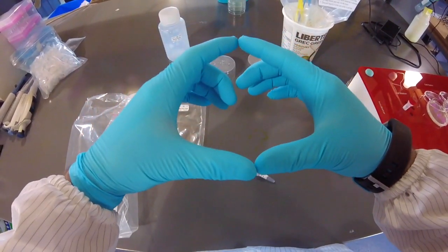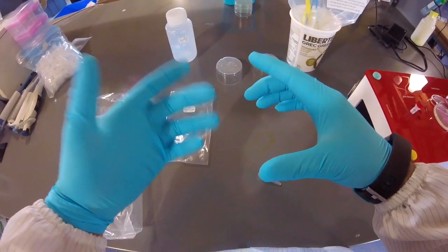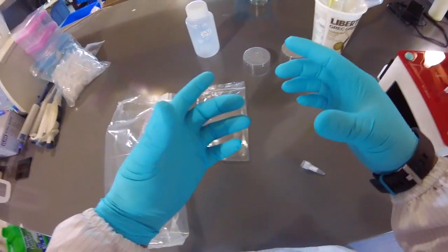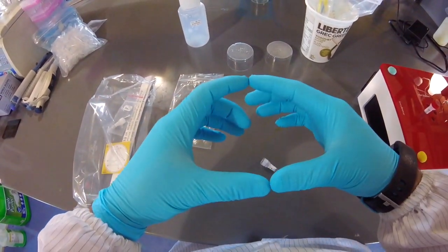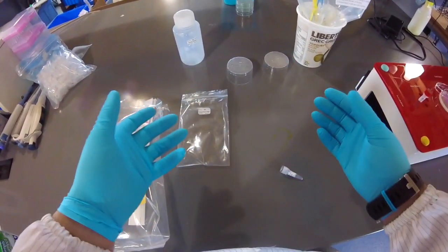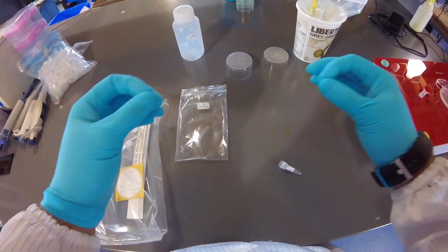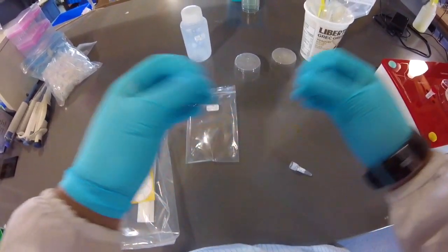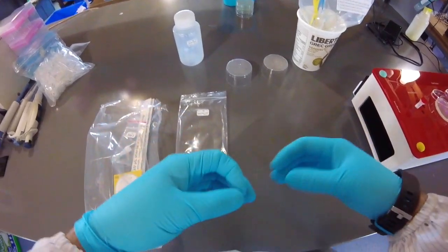And it's really neat because you can have lots of different origins of replication that will tell the cell to keep different numbers of these plasmids within the cell. So for example, keep 2 plasmids in the cell, or keep a few hundred plasmids in the cell at any given time. And this is really important because you have to remember that the cells are going to grow and divide, right? And so if that plasmid you add also doesn't divide, eventually the cells that split off, as they split through binary fission, one of the 2 cells wouldn't continue to have any plasmids, right?